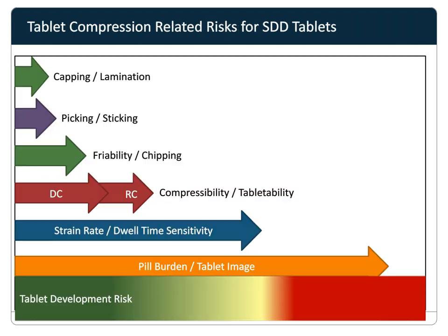Okay, so related to tableting, this slide has common development-related issues with associated risks for SDDs. And really these are based on our experiences. And one thing to note is the slide does not take into consideration powder flow, which can be an issue as well. But in general, SDDs are not as difficult to tablet as crystalline drug. Typical crystalline API properties that cause trouble are generally masked by the amorphous state of the drug and by the polymer.